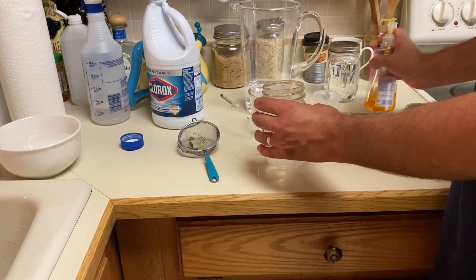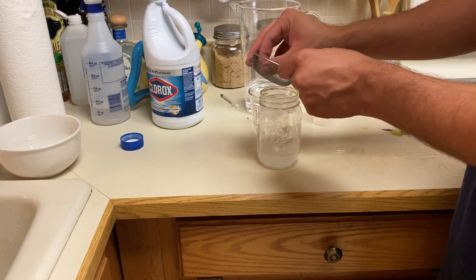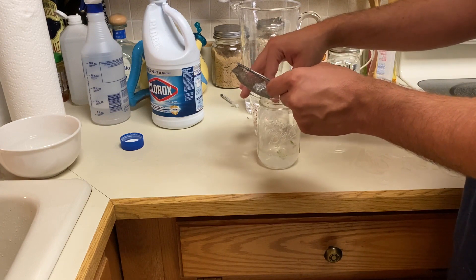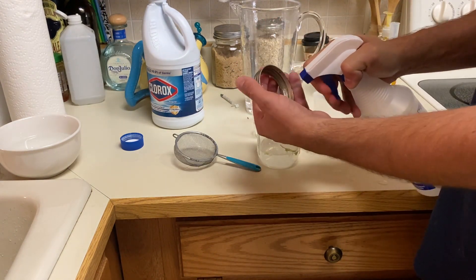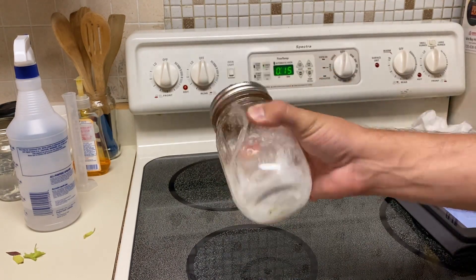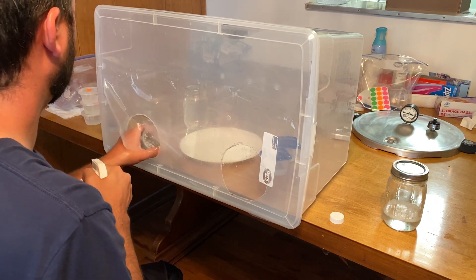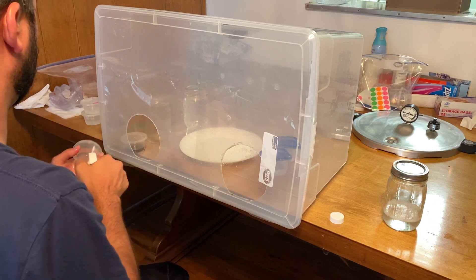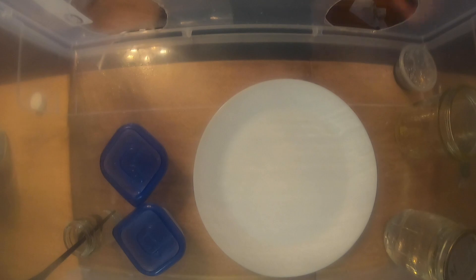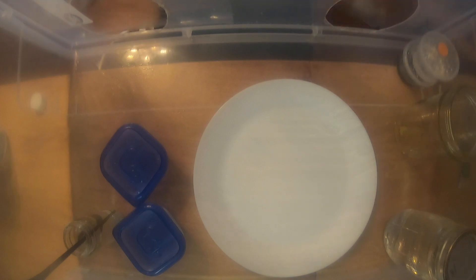Add about a drop of the antibacterial hand soap — the soap helps break the surface tension and helps sterilization a lot. Add in the plants, set an alarm for 15 minutes, and shake for 15 minutes. After 15 minutes is up, spray down the media cups with rubbing alcohol and put those into the still air box — I'm just doing three cups for this video.